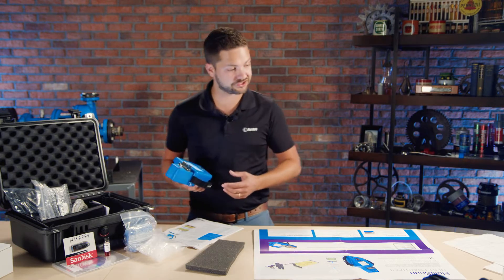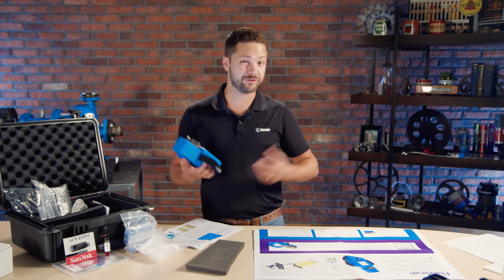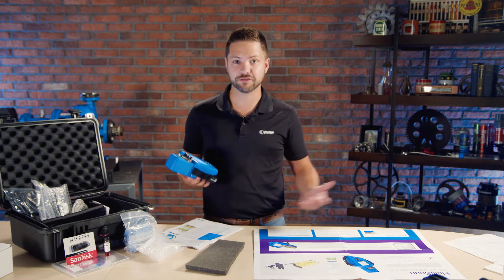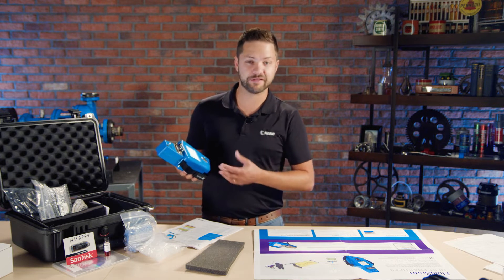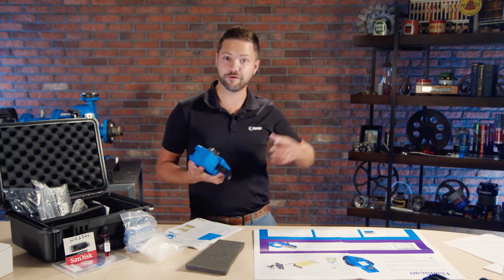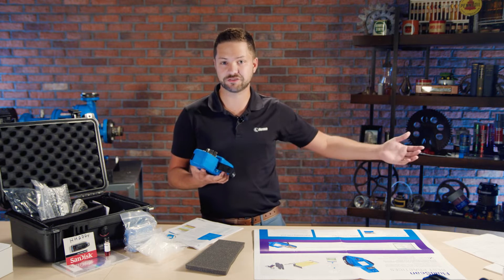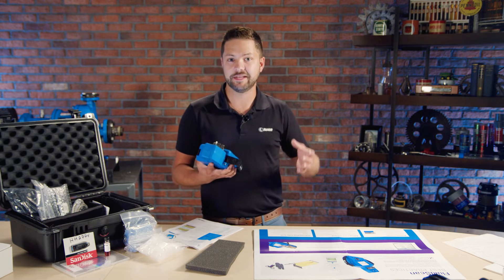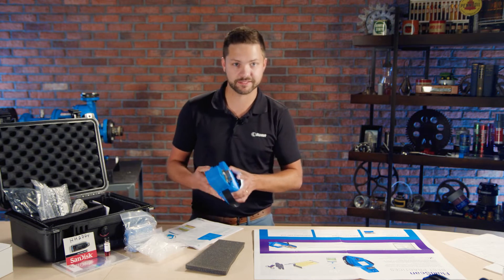I'm anxious to go get a hydraulic fluid or gear oil to test. You can test most any kind of mineral or synthetic oil for any kind of application. Most will have an ability to be tested by this to see whether or not the machine that oil came from needs to have the oil changed or needs to be serviced. That's the key benefit — knowing whether that machine needs service right now from a quick test like this.